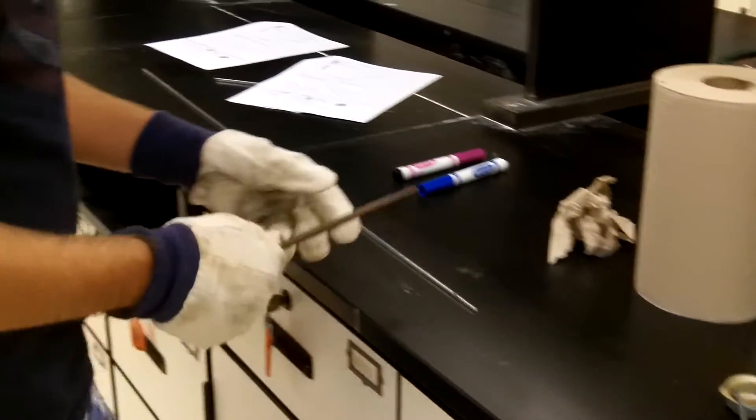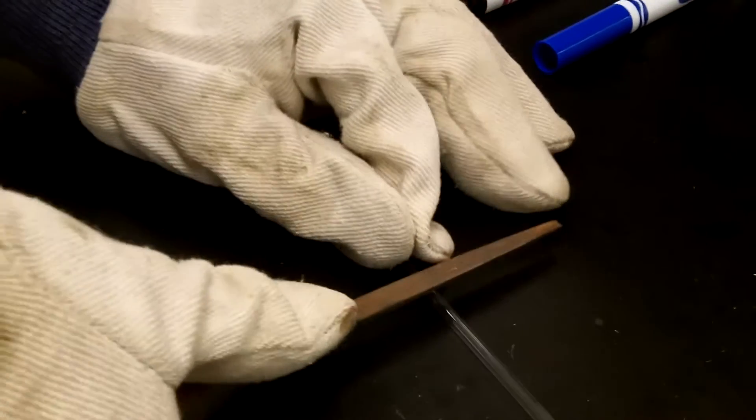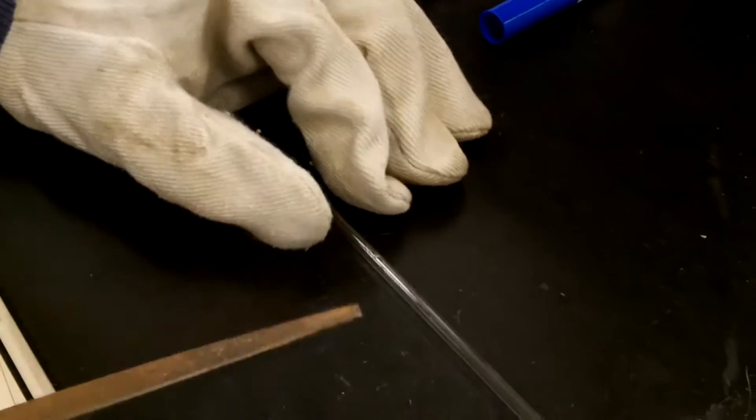When ready, pick up a triangular file and make a mark on the glass tubing. Then, pick it up, point the mark away from you, and snap it in two.